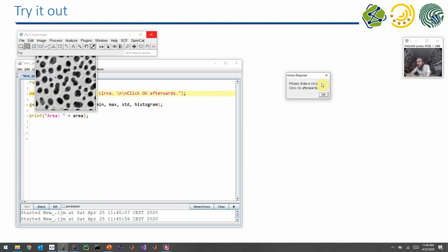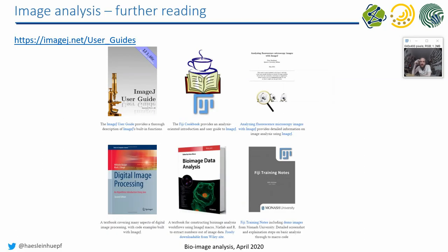So I tend to add this "click OK afterwards" sentence usually, because often people click on OK and want to draw the circle afterwards. But unfortunately, it's not working like that. It works the other way around. You have to draw the circle first before you click on OK. And that's why I tend to put this additional sentence in here.